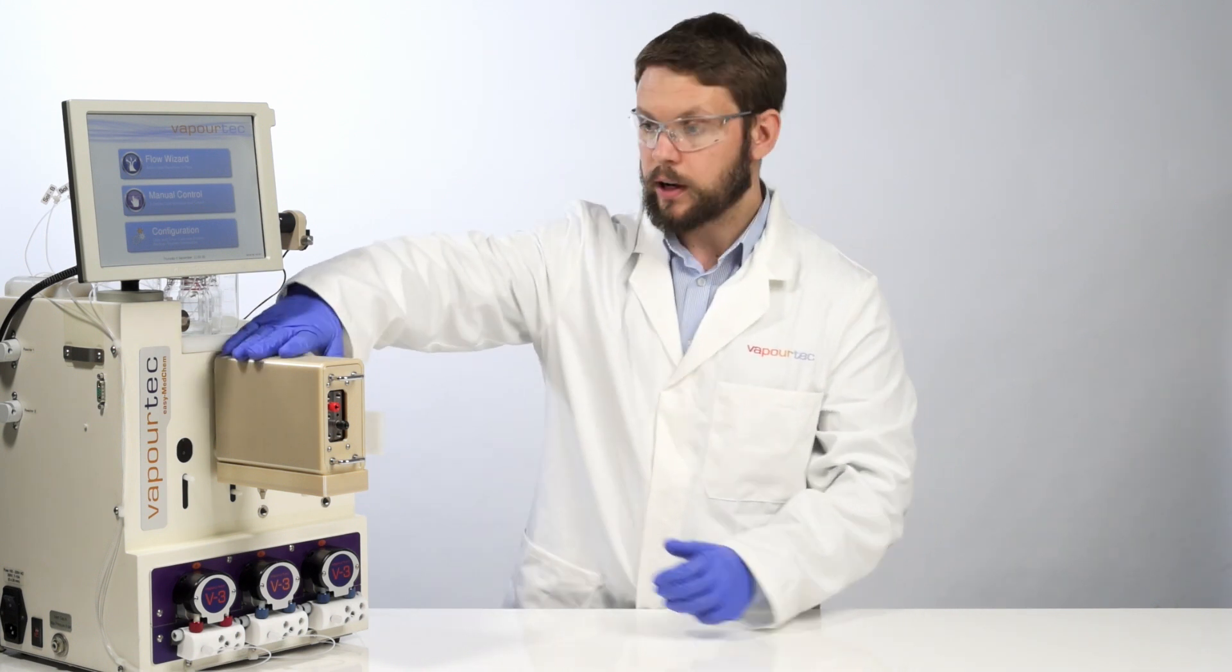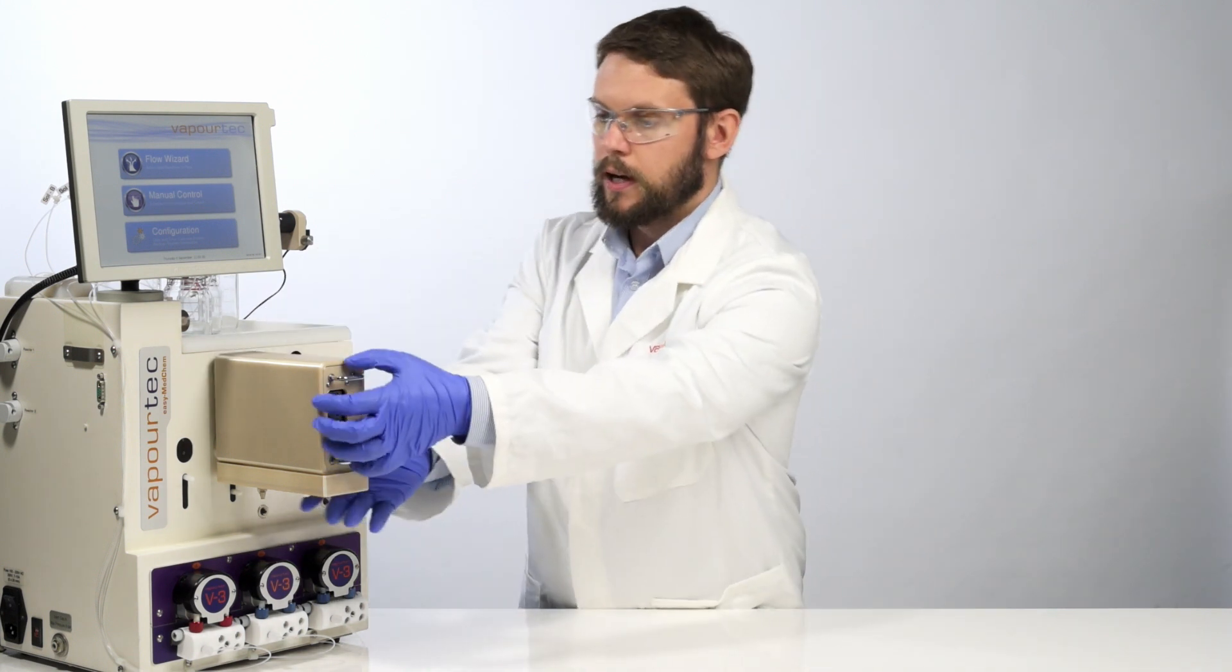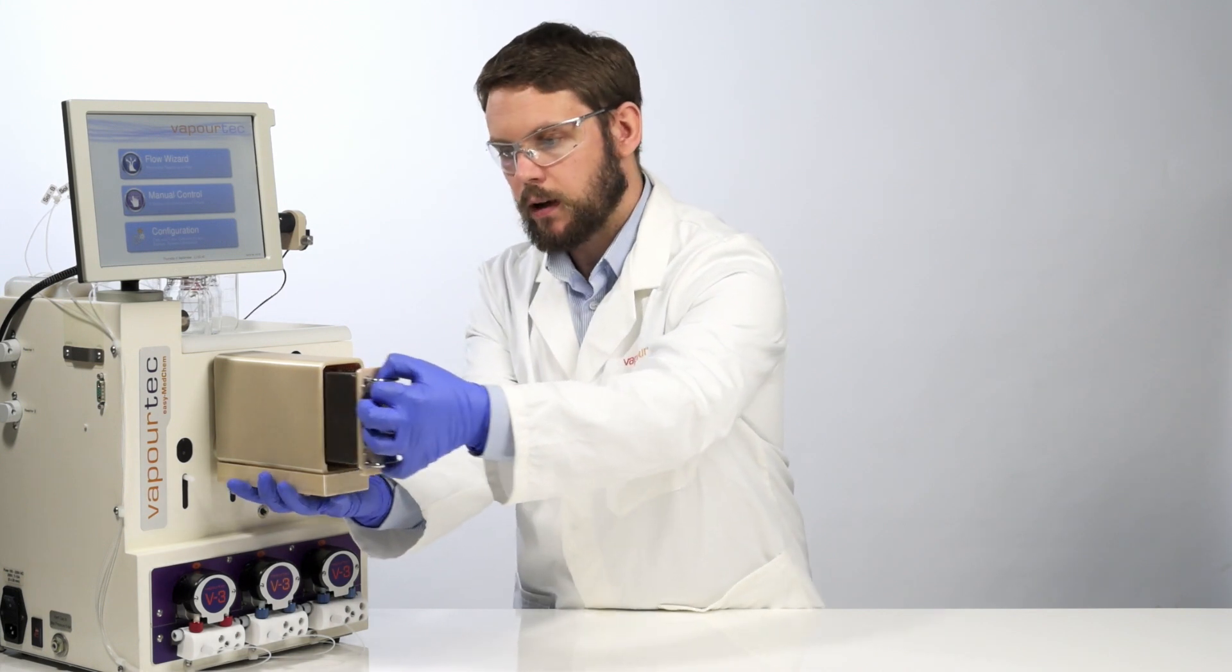Like all of the VaporTech reactors, the ion locates on the front of the system and you can remove the reactor from the body like this.